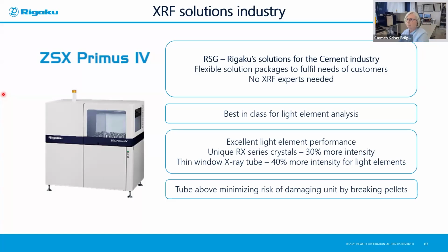If you take an example of a limestone, because it's an easy example, limestone consists of calcium carbonate. So of course, the balance of this material is carbonate, and carbonate cannot be measured by XRF. So we complement this kind of analysis with the balance of the material.